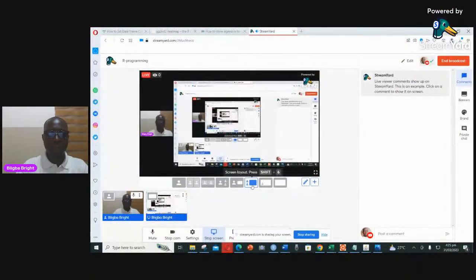Okay, so I'm going to show us how to visualize the output of Roary pangenome analysis in genomics. It's quite a bit of an issue to some people. So let me share my screen. My screen is already sharing, so I'm just going to pull up a few things here.